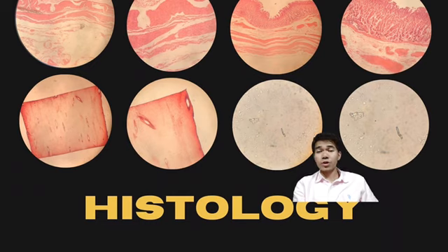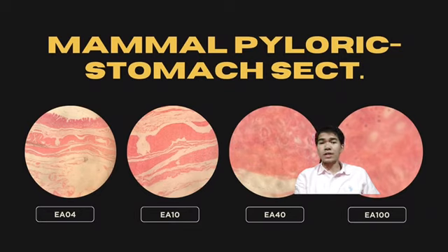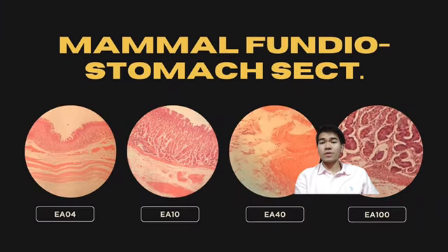On the histology, or the study of the tissues, we have 4 different specimens. The first one is the mammal pyloric stomach section. It is characterized by a pinkish to purple section displaying mammalian pyloric stomach, likely with glandular structures. And then the next one is the mammal fundic stomach.